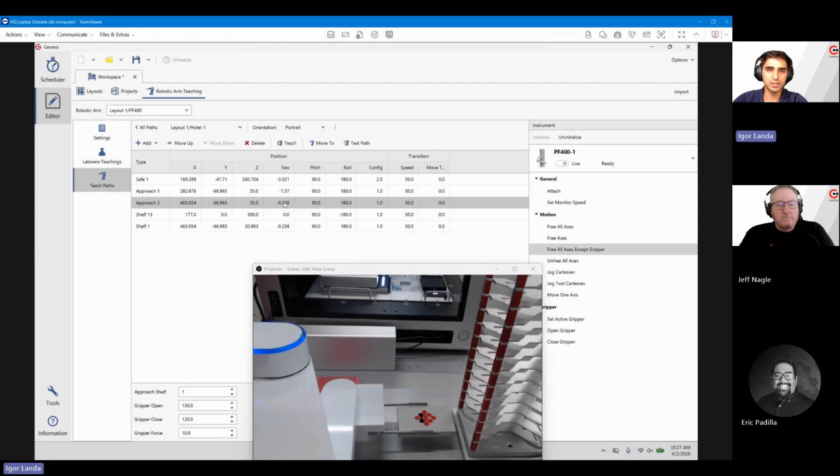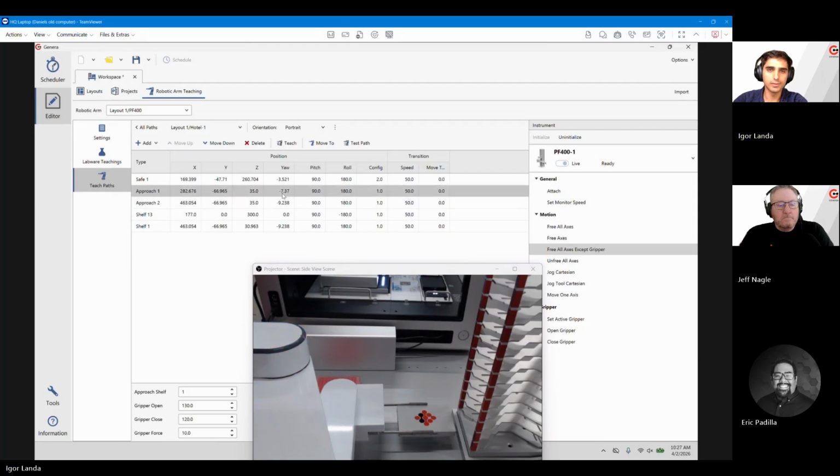And also the yaw. We could. So now we know that it's just because the arm and the hotel are parallel to each other, so it should just be able to go straight into that shelf. Yeah, I think it's important to put some context to this.